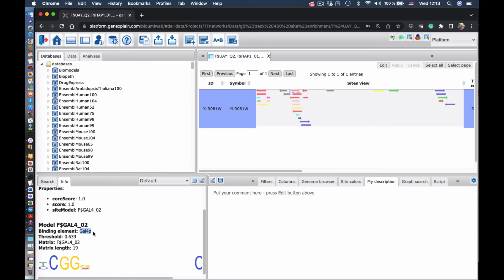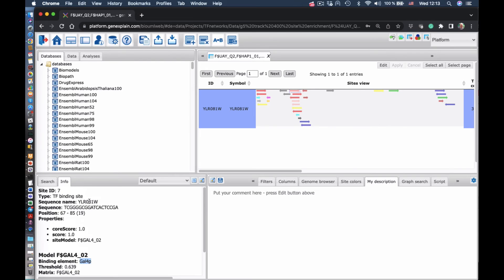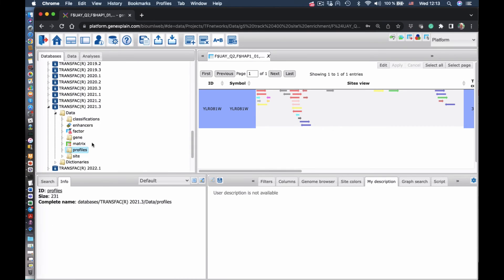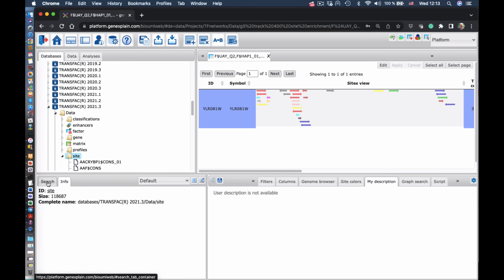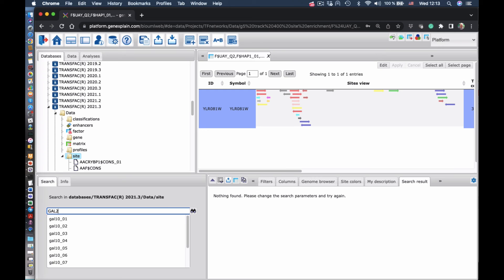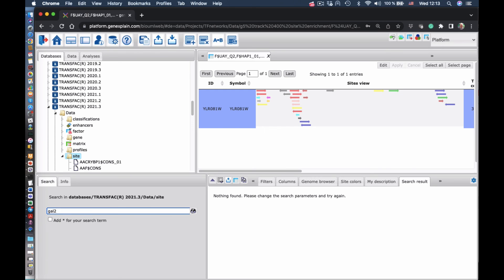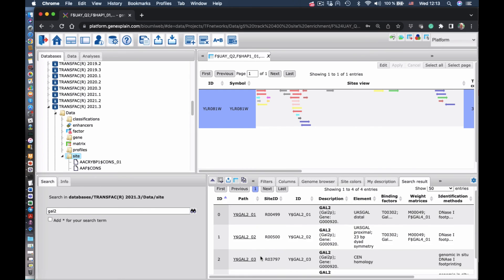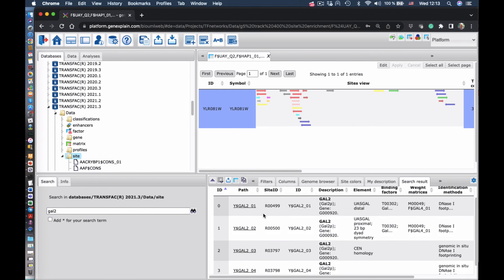For instance, this site in the GAL2 gene can be searched in the transfac database among the experimentally proven sites. Here you can go in transfac and search for GAL2 gene. And we see all the experimentally proven one site in that gene.